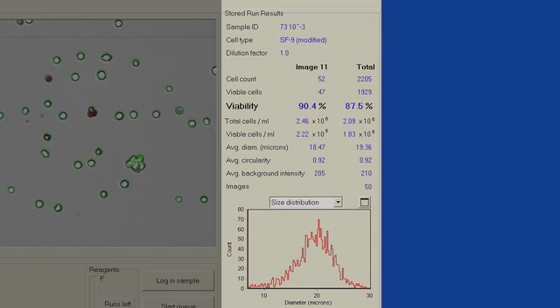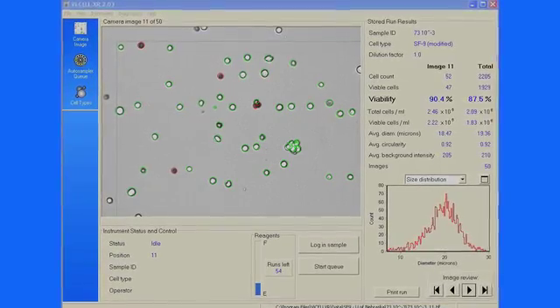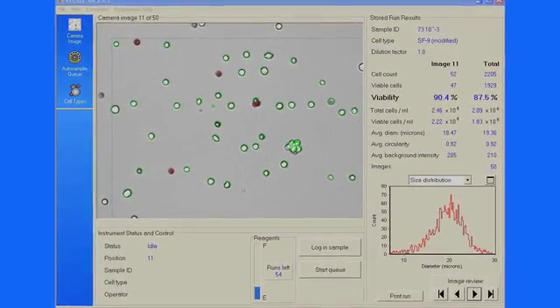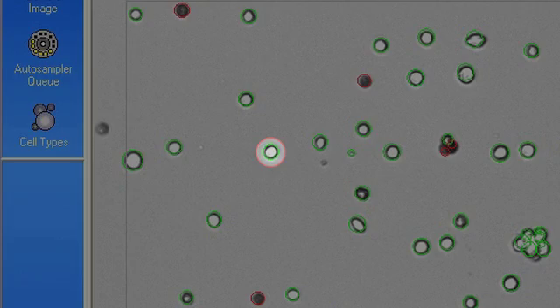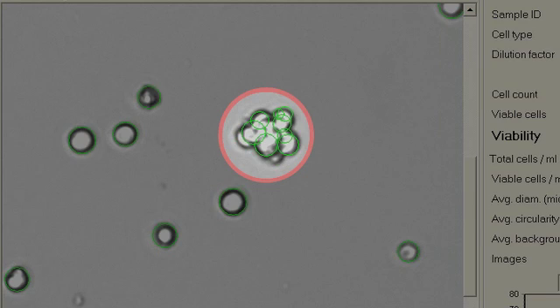Based on the image parameters of the cell type, the software indicates which cells are viable and non-viable. Viable or living cells are circled in green; non-viable or dead cells are circled red. The software can even count individual cells in cell clusters if you have clumpy samples.